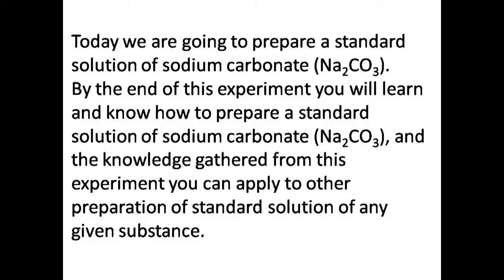Today, we are going to prepare a standard solution of sodium carbonate. By the end of this experiment, you'll be able to know how to prepare a standard solution of sodium carbonate, and the knowledge gathered from this experiment you can apply to other preparation of standard solutions of any given substance.